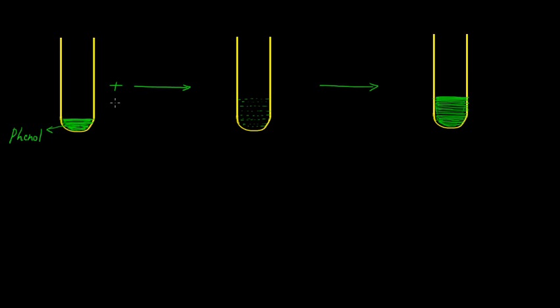In the first step we can add 10% NaOH into this test tube. When we are adding 10% NaOH, at that time this phenol will get dissolved into NaOH solution and we will get a clear solution in the test tube.